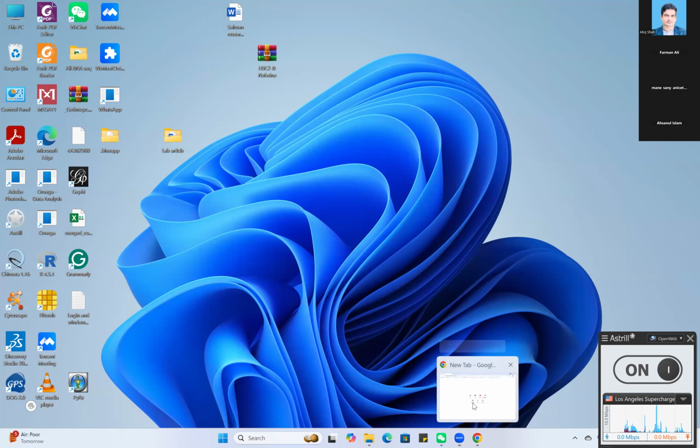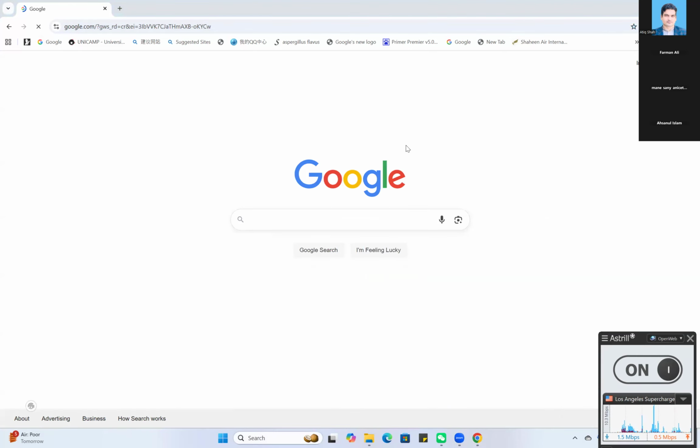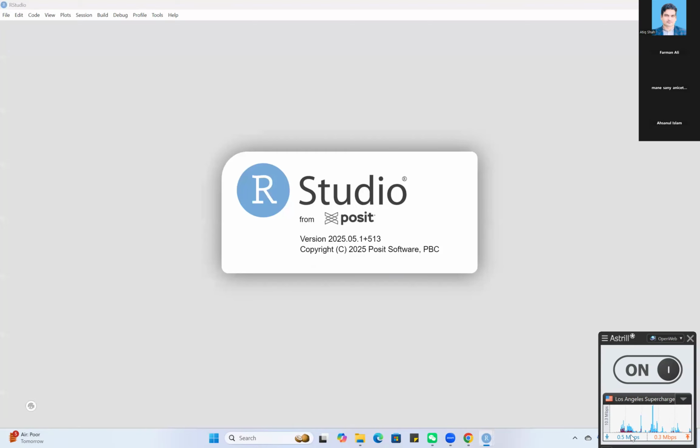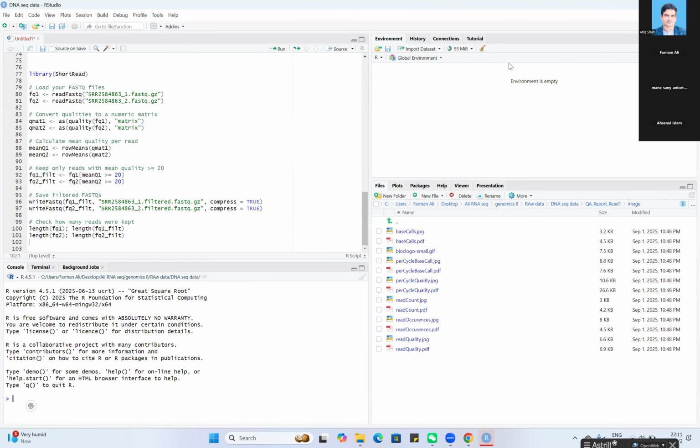Okay, thank you. Now please open RStudio.